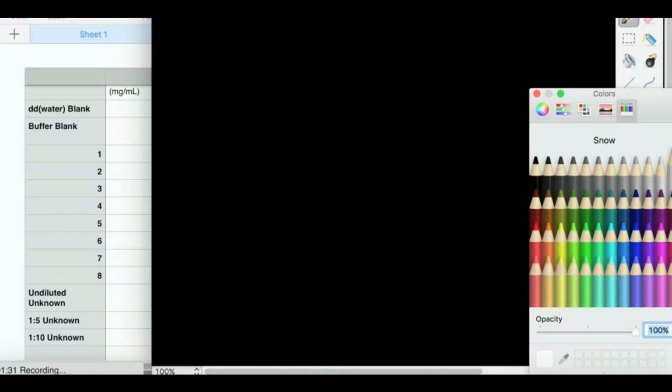We've already learned about the theory of UV-Vis spectroscopy. Now, what do we do with it? Well, one of the things we can do is if we have a solution, and in general, what we have in UV-Vis is a cuvette. Now, one of the things that normally confuses students is when you get to this point where you can actually generate an equation and you solve for things, there's something in Beer's law that always confuses people.